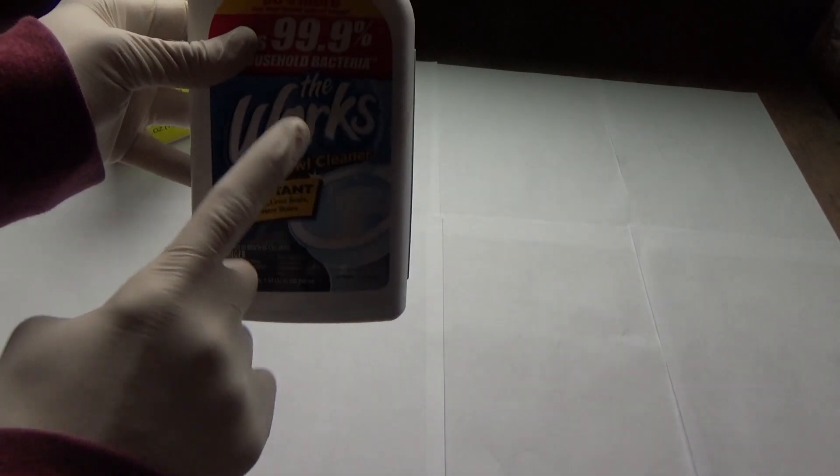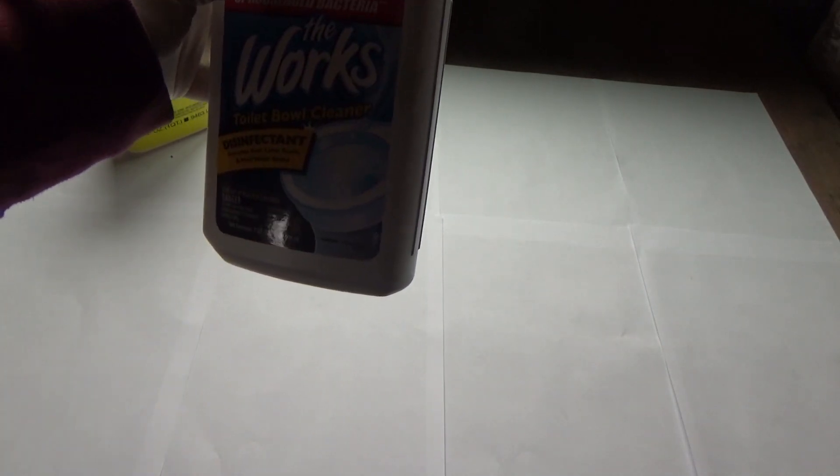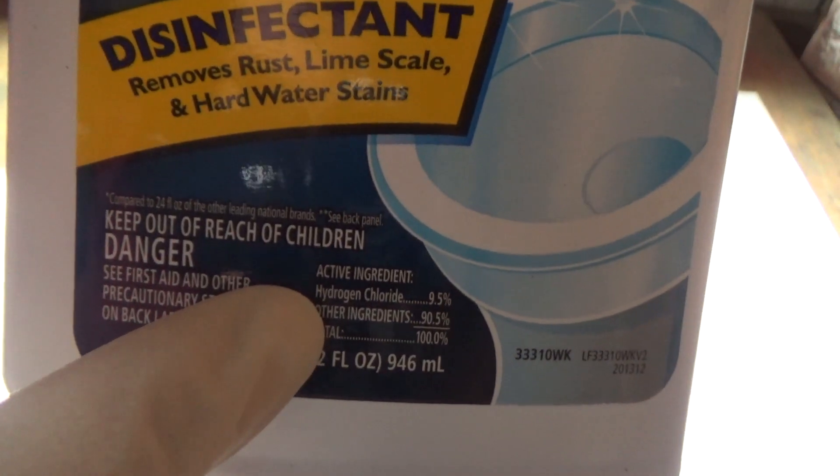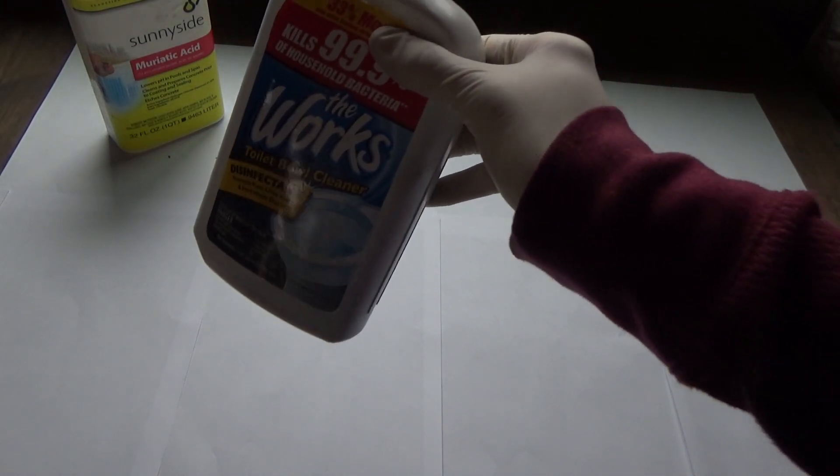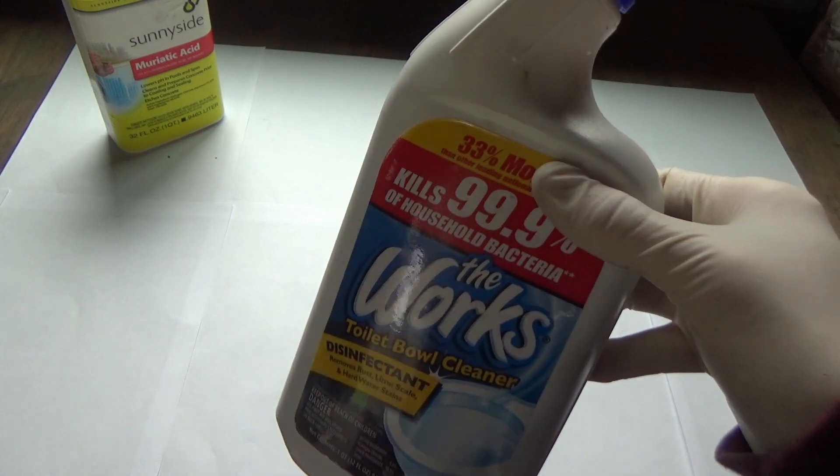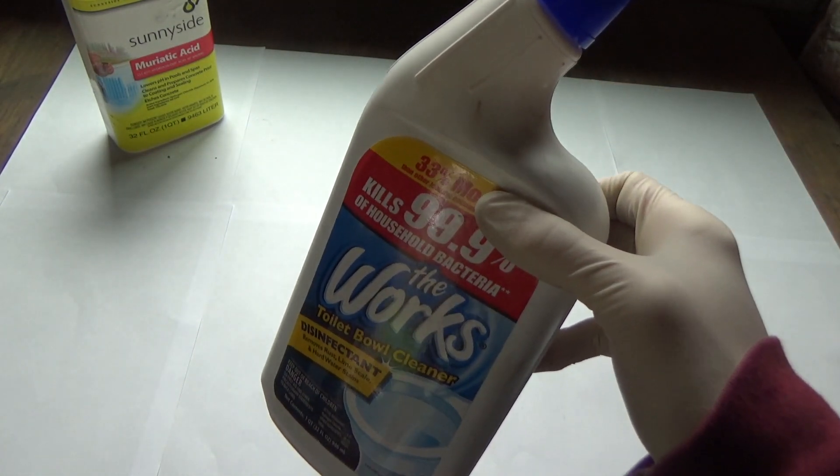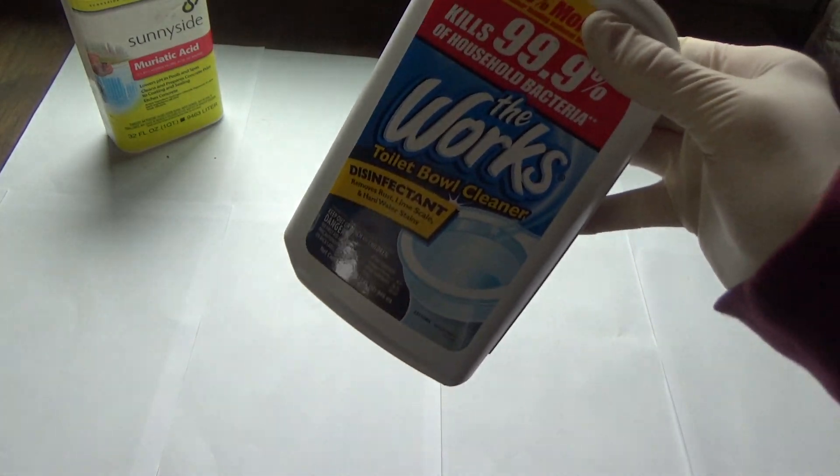If you don't have muriatic acid, which is just hydrochloric acid by the way, then sometimes these toilet bowl cleaners or cleaners in general might have hydrogen chloride in it. This only has 9.5%, while this is 31.45%. But some brands have up to 25% hydrochloric acid. The most I've ever seen in a store is 20%.